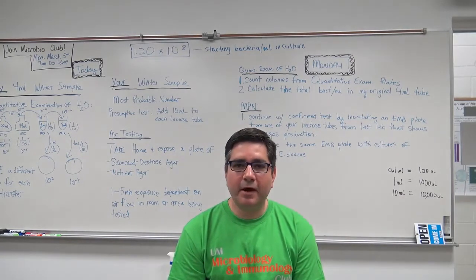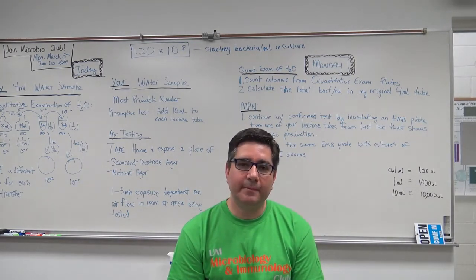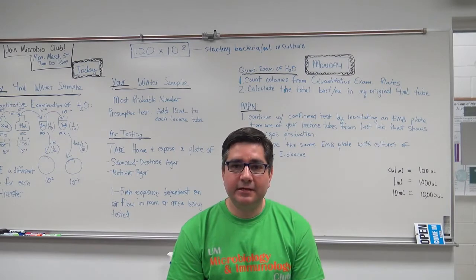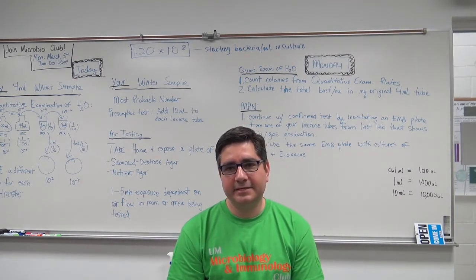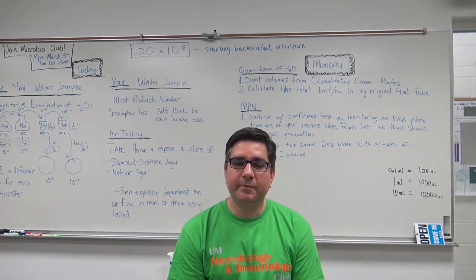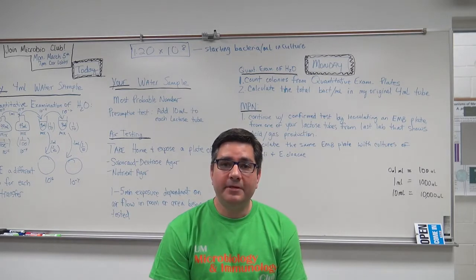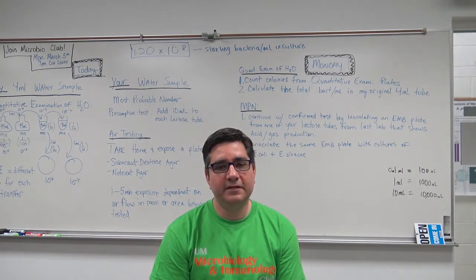As this procedure requires many lactose tubes, some at double and some at single strength, and using various volumes of the water sample, we will instead be conducting a modified and scaled down version of the MPN test in lab. Be aware that to conduct the MPN properly, you will need to perform the test as it is illustrated in your manual. Since we will not be doing anything with the organisms we obtain from the confirmed test, we will not be conducting the completed portion of this procedure.